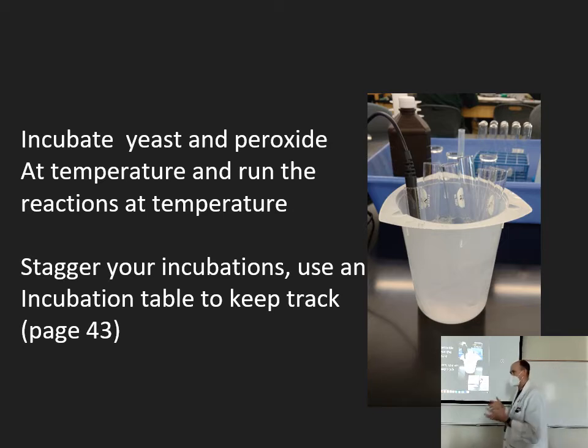That's when you put water and ice in one of your big beakers, and you can stick test tubes in there. Each bench has one temperature probe that hooks to your computer and one thermometer, a regular old school alcohol thermometer. It shouldn't be mercury, but we have one of each. Technically, this is easier when we have labs of groups of 4. If you are on the ball, you could be warming some up while you're also cooling some off and run them at the same time, with thermometers in each. That might be hard with groups of 2. I'll pair you 2 up today, by the way.